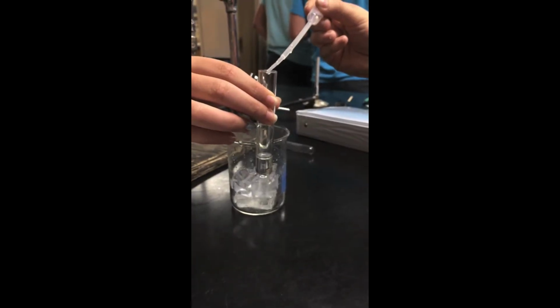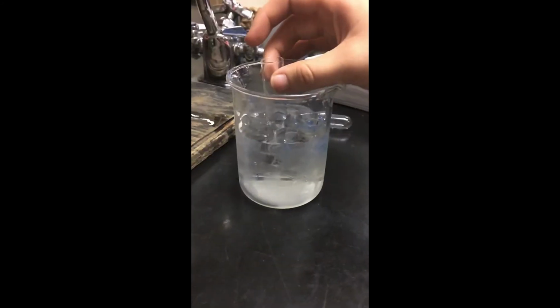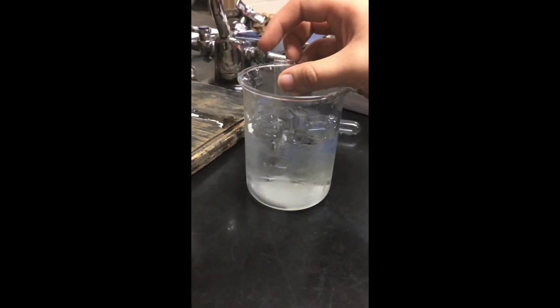We filled a small test tube about 1/4 of the way full of magnesium sulfate. Next, we added a few drops of calcium chloride. We placed it in an ice bath for 1 minute.